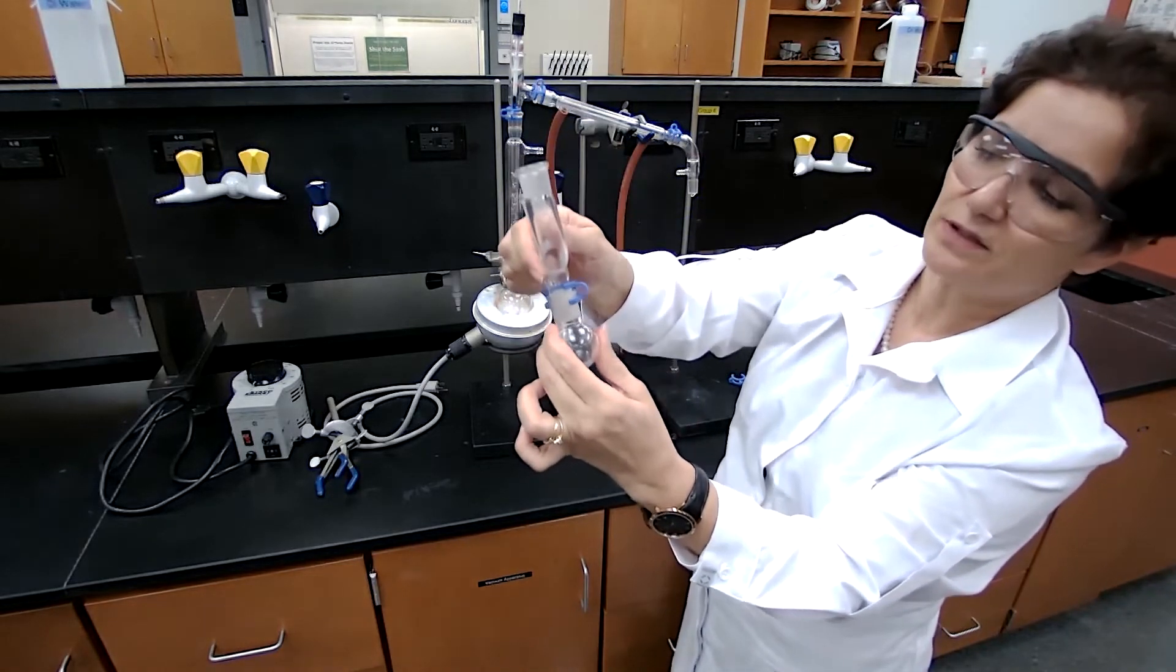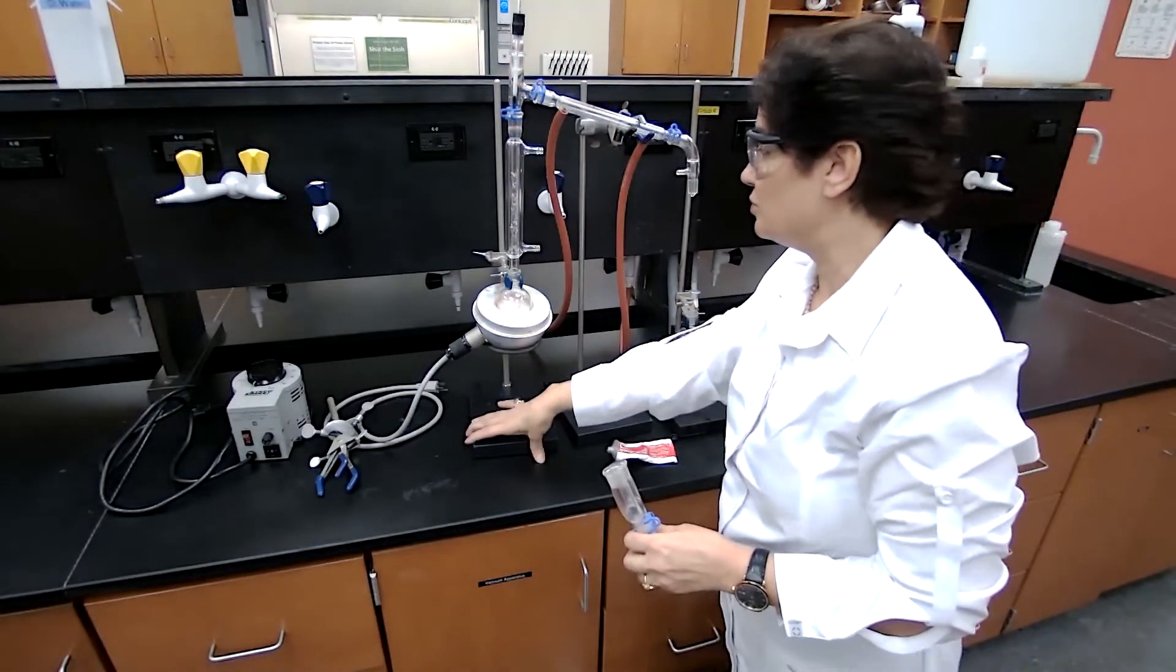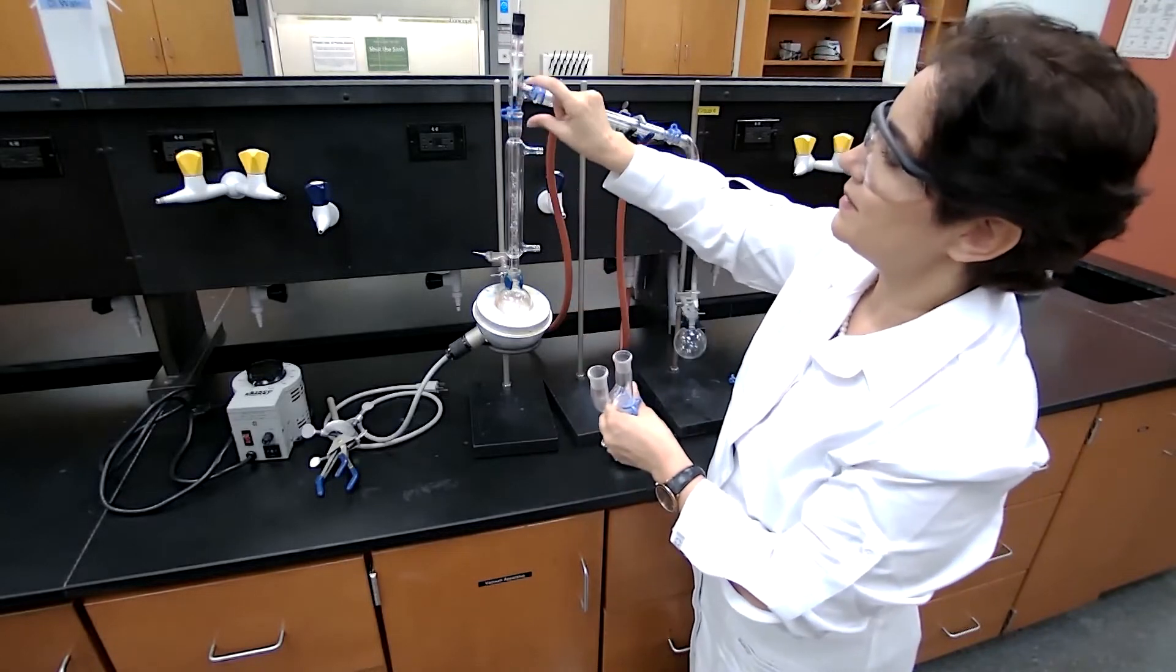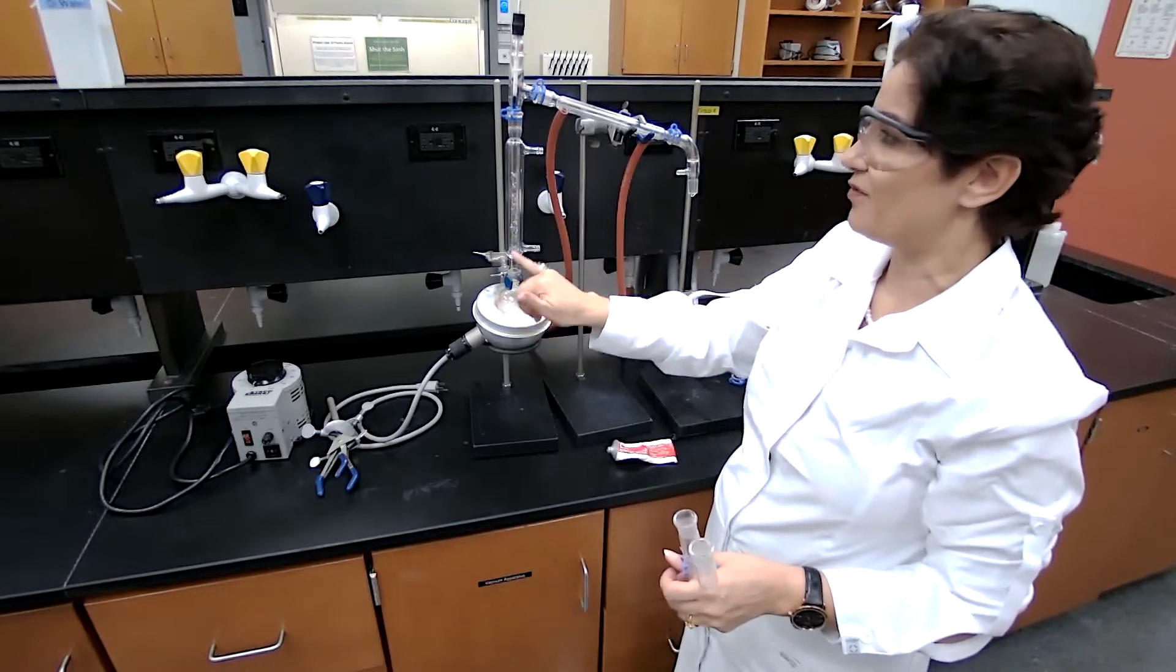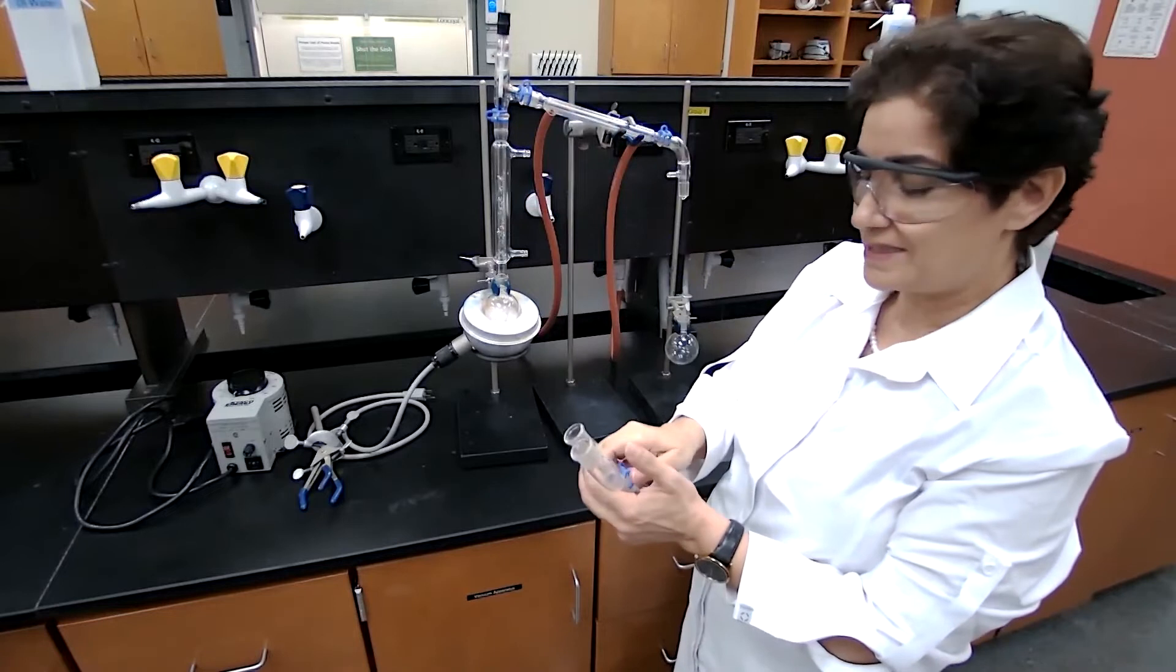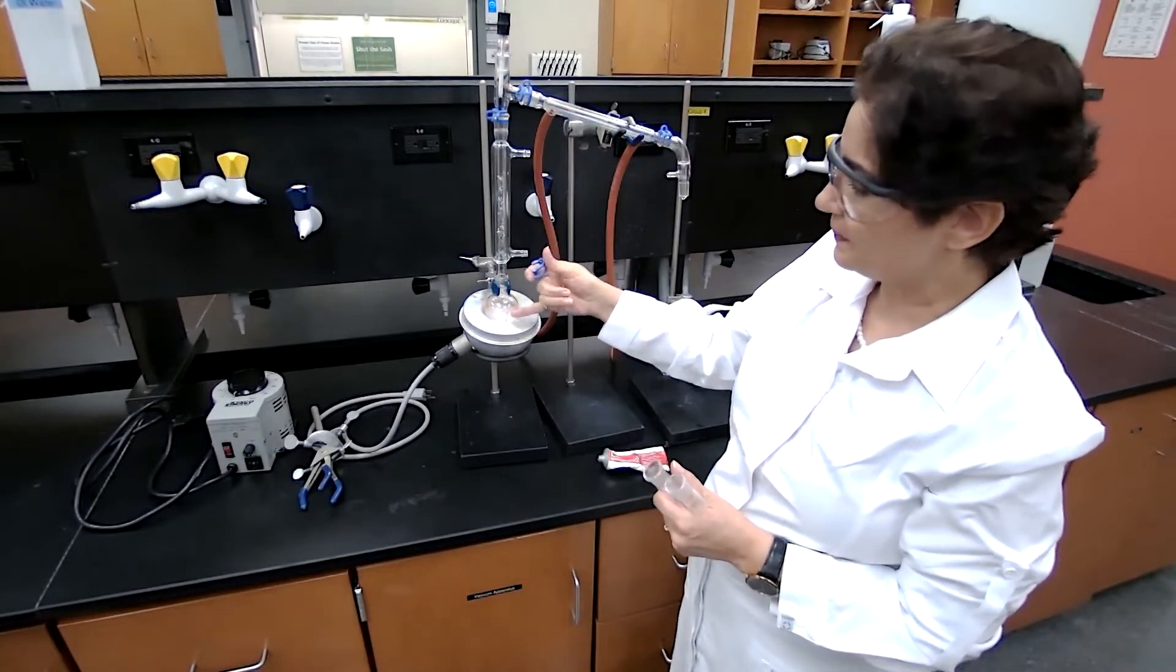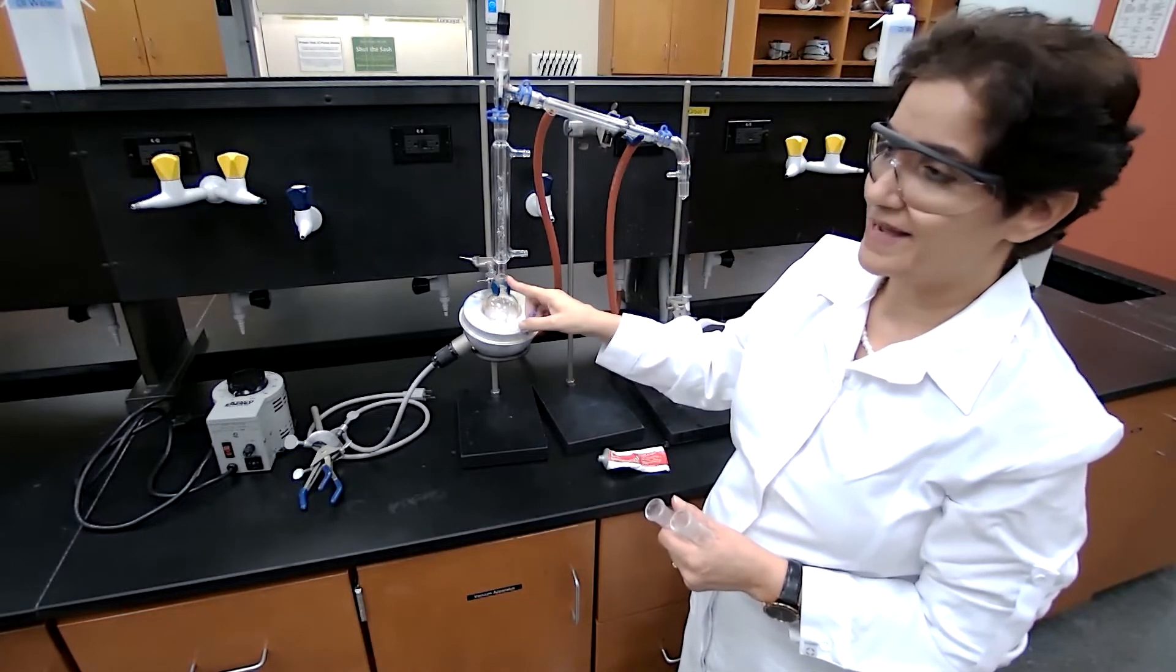It holds it together. After you set up your distillation, sometimes you move things around when you heat up. We don't want these glass joints to get separated because if it gets separated then you have an opening for the vapor to leave the system. We want to make sure that all the glass joints are trapped. After I place the chemical during the experiment, I put one also for the boiling flask.